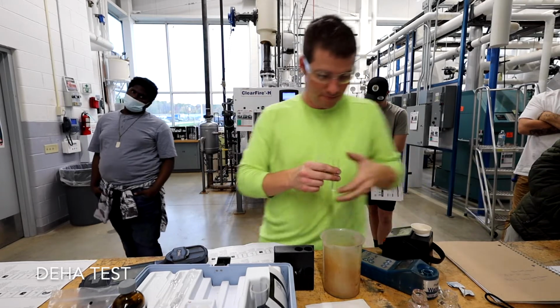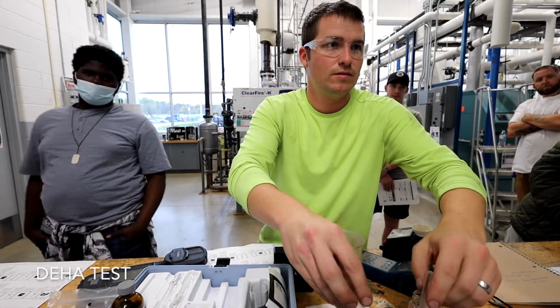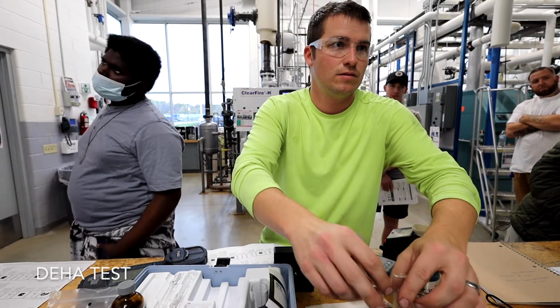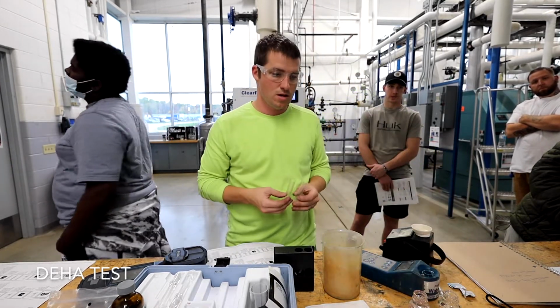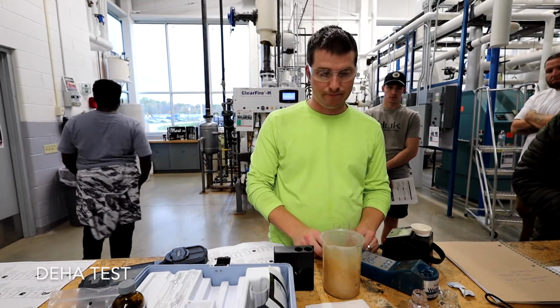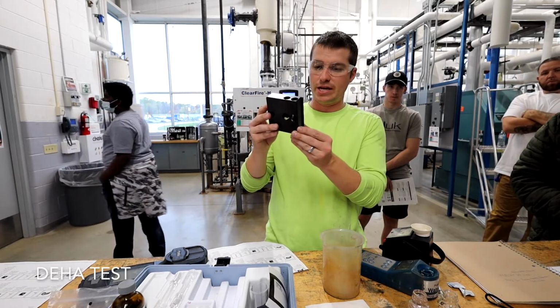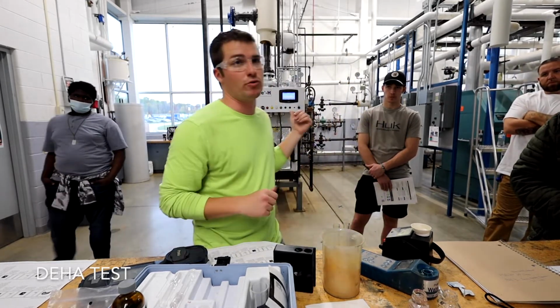I don't think I've ever had a test that has been a very large contrast. Is that supposed to be more purple? Yeah, it would be more purple if we probably had 500 or whatever where we want to be. I've never come close to that. So that's simply a matter of we have to run that pump more.